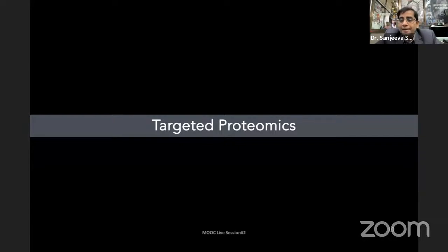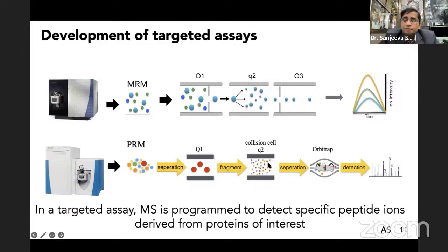Conventionally, people used to validate the targets using antibody-based approaches like ELISA or Western blots. But for every protein, we don't have good antibodies available. For many, only polyclonal is available. So how do we validate the target? Since we are acquiring data from mass spec, which is about peptide sequences and their quantification, the idea came: why not validate those peptides using a different type of mass spec?